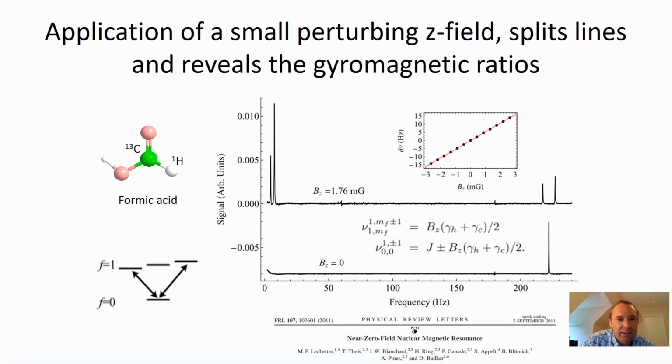I also noticed a question from Raman. Is it absolute spectra or real part? These are real spectra. We'll talk a little bit about imaginary versus real versus absolute later, but these are all real. You can tell that it's real, for example, because you also have negative contributions here in some peaks of the noise.